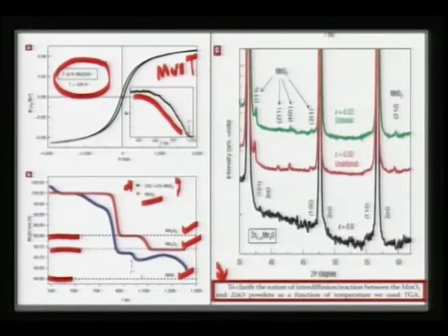Okay. Now, we can resort to the bulk X-ray pattern. So, these are the bulk X-ray patterns. This is for zinc oxide, which shows the hexagonal structure, and this is characterized by 3 intense peaks, one around 35, one around 47 and one around 57. You see these 3 peaks, and suppose you are going to take 2% of MnO2 and mix it with this ZnO, you would see for the unsintered sample there are some signatures here which are not present in the pure ZnO.